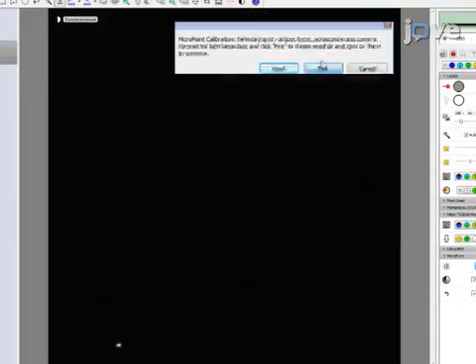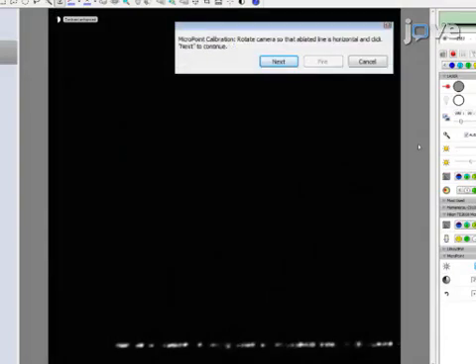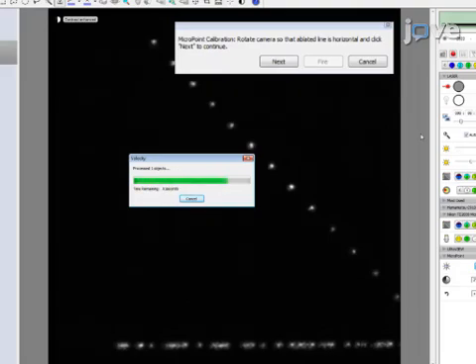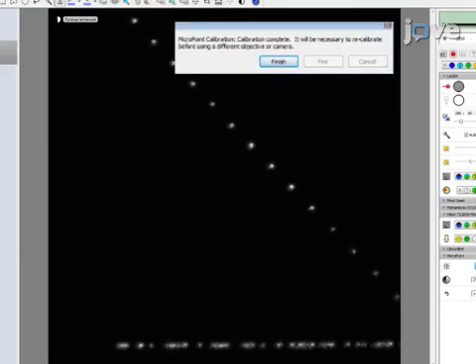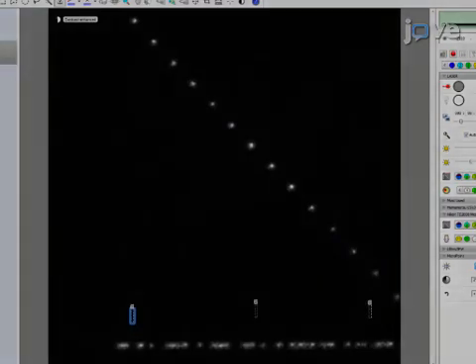Start the calibration procedure. The software will fire the laser to etch the mirror slide along a horizontal and diagonal line. These lines define the boundaries of the field in which the laser can strike a target cell. Set several regions of interest, or ROIs, inside the field.